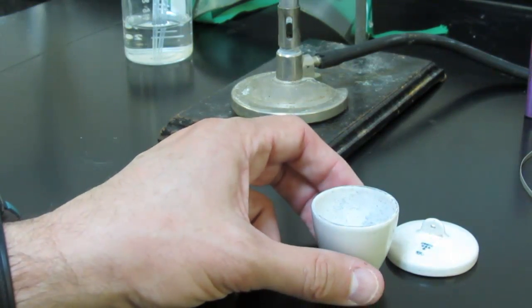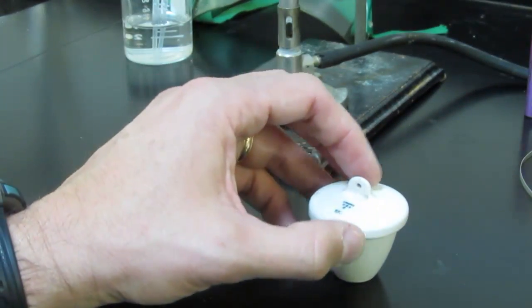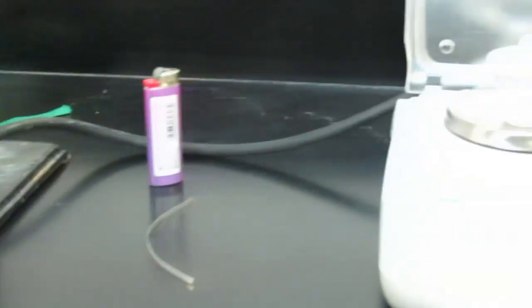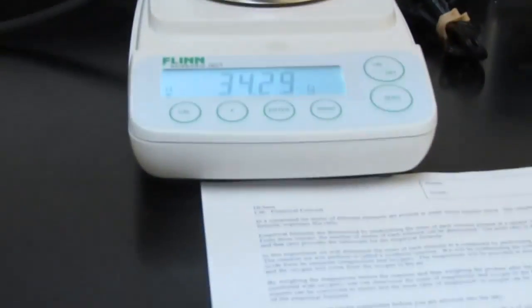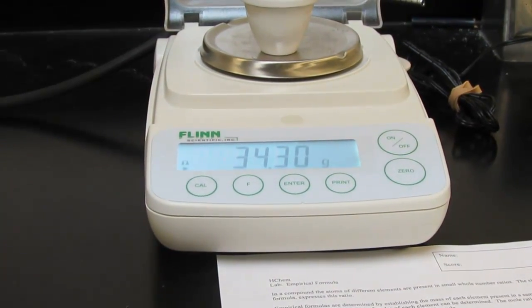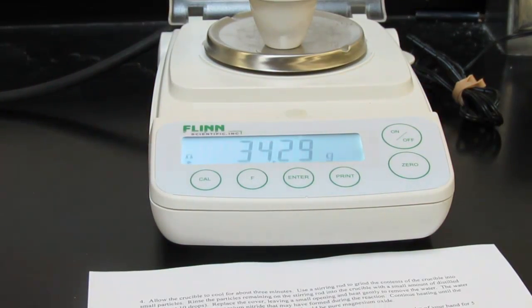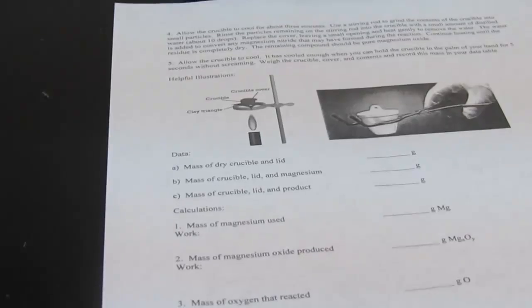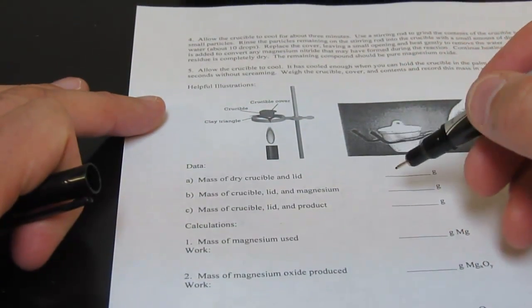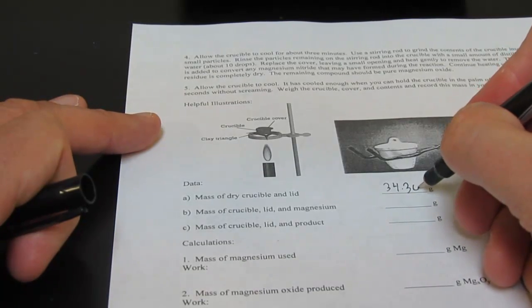So we're going to take our crucible and our cover, and we're going to go ahead and put them on our balance. And I'll do that right now. And we'll take the mass of that. So the mass of our crucible and cover empty is 34.30 grams. So on our data table, we have a spot for the mass of the dry crucible and lid, which would be 34.30 grams.